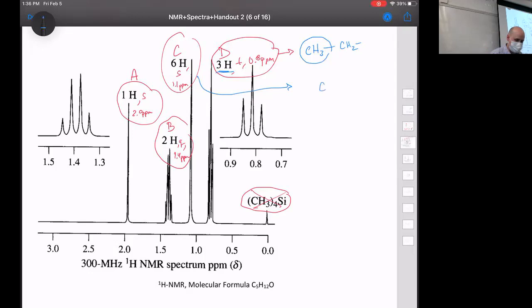All right, so does that seem reasonable, 2 CH3s? Tell me about what they're connected to, though, because they've got to be connected to something. And the 1.1, I think G would be attached to the CH2 over there. Well, they can't be next to the CH2 because they don't have any hydrogen neighbors, right? Okay, so let's look at what we have in this molecule. There are only 3 things: carbons, hydrogens, and oxygens. Can there be a hydrogen that they're attached to? No, because then they'd be CH4s, and they're methane, and they're floating in the room, right?